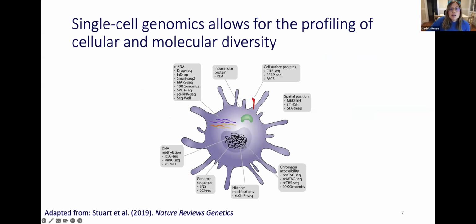Single-cell genomics gives us insight into many cellular features, and comprehensively profiling the molecular processes of cells can help us to differentiate and define healthy and diseased behaviors. While several methods have been developed to characterize the different aspects of single cells, such as cell surface proteins with FACS or chromatin with ChIP-seq, there has been a significant focus on mRNA since it's relatively easy to capture and can be used to explore everything that a cell aspires to be.